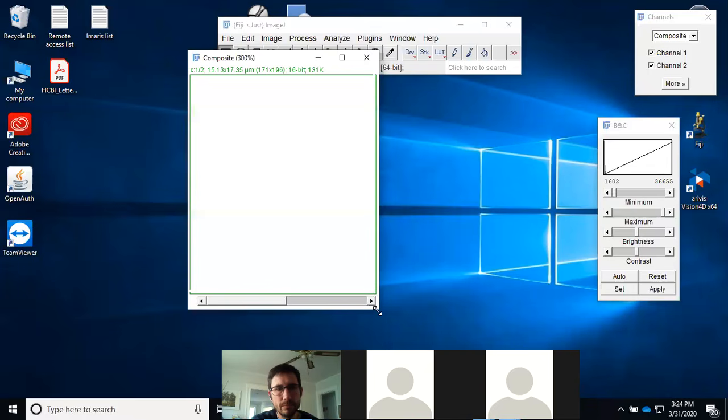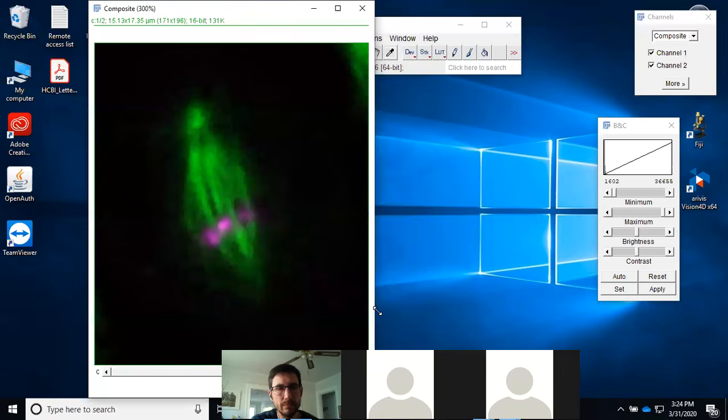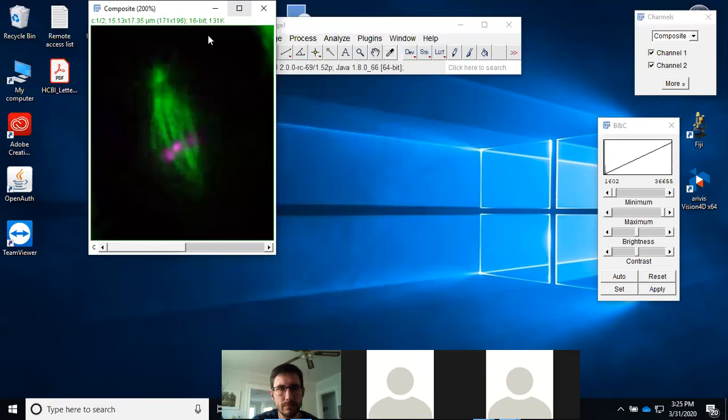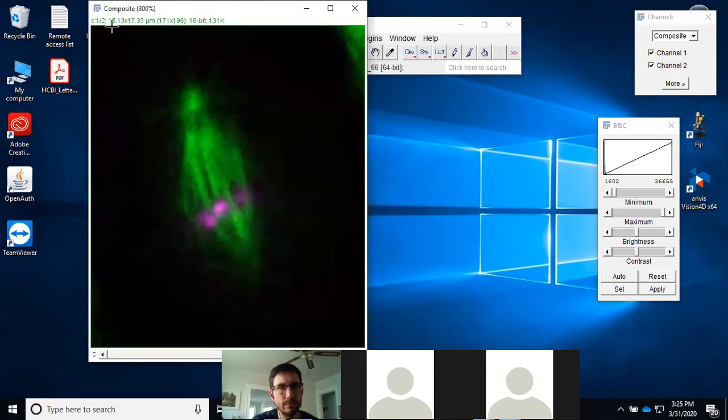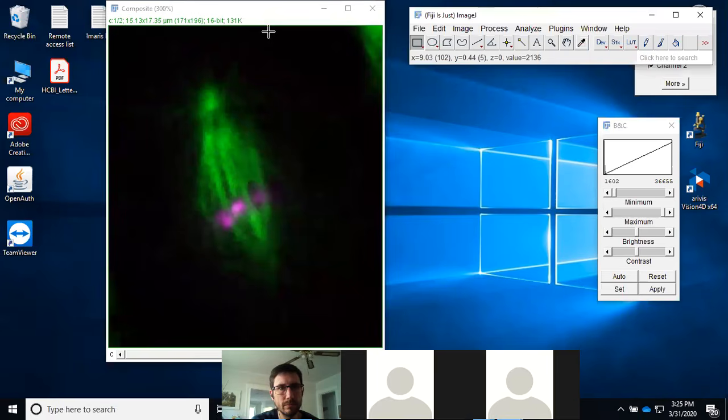If you have 5 pixels, it will take the middle value pixel, exactly the value of the middle value pixel, and replace that pixel by that value. It's not going to multiply your pixel values with a Gaussian curve. So it retains data. Okay, thank you.